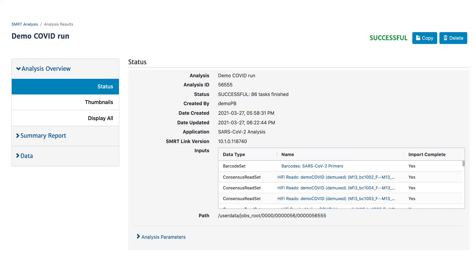For one SmartCell worth of demultiplexed data, the workflow completes within 30 minutes using our default recommended computing configuration.